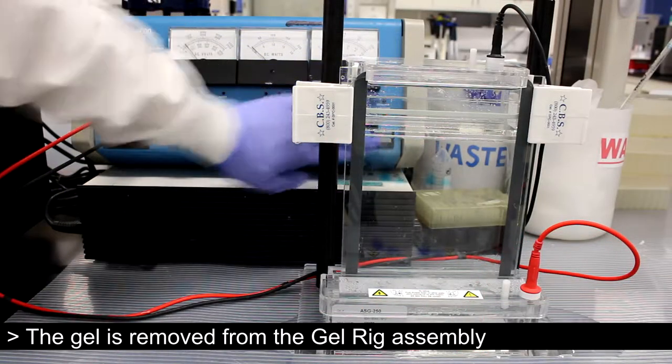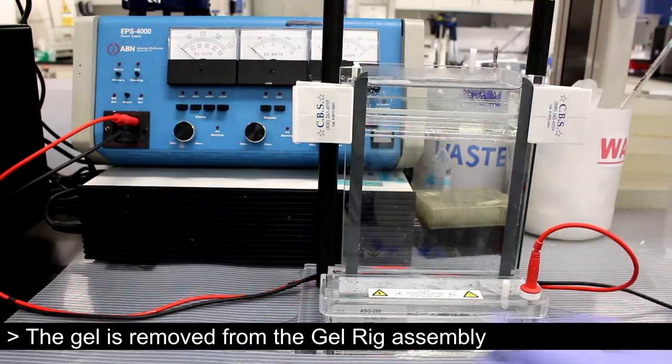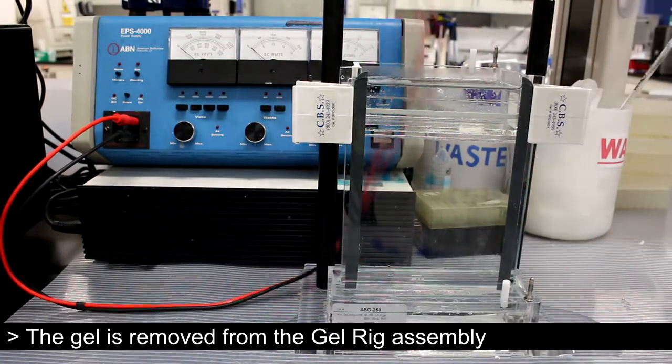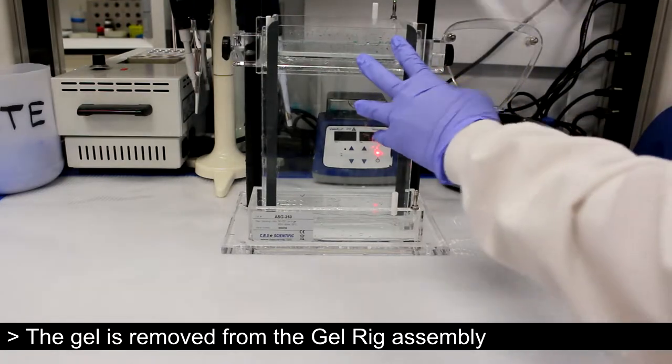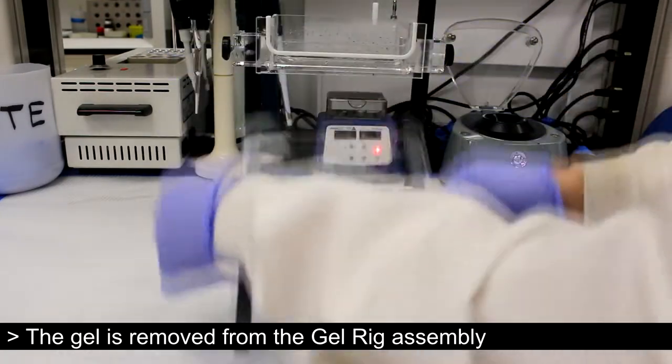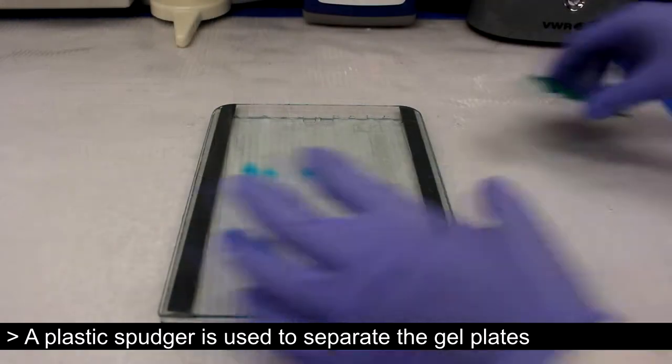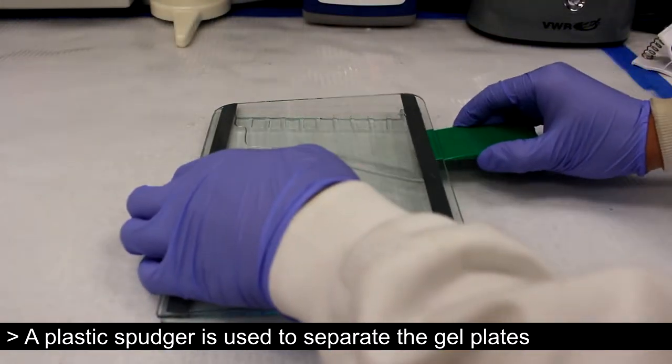After sufficient separation, the gel can be removed from the gel rig assembly. The gel plates can be separated using a plastic spudger.